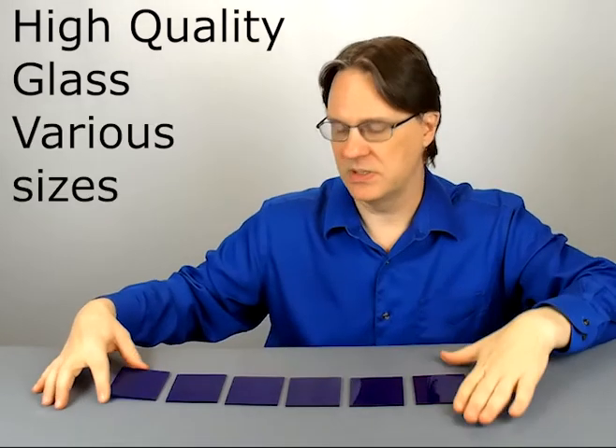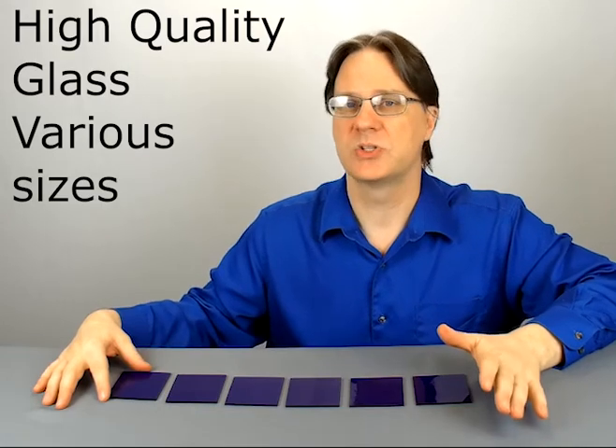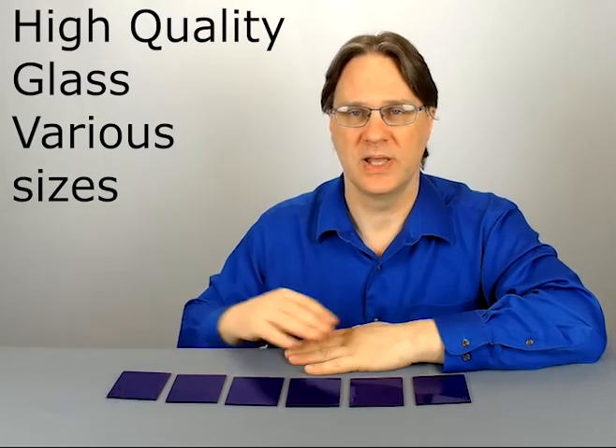They come as a pack of six and they come in three different sizes: two inch square, three inch square, and four inch square, so you're going to find something that fits your needs for your classroom.